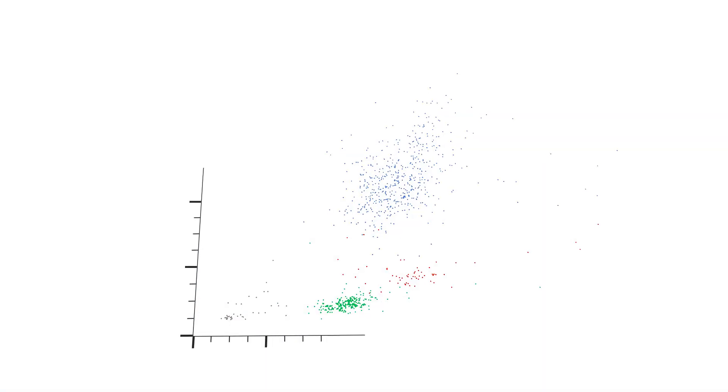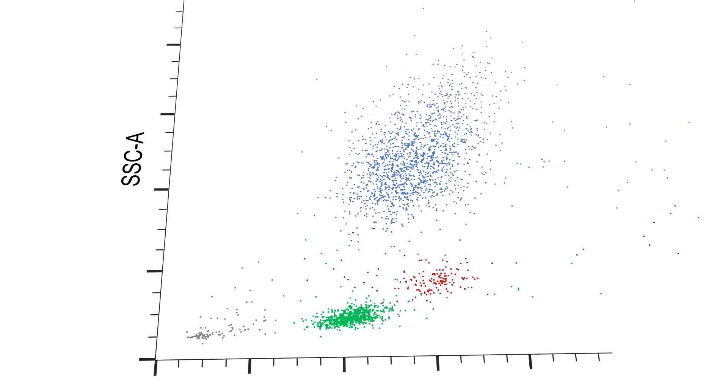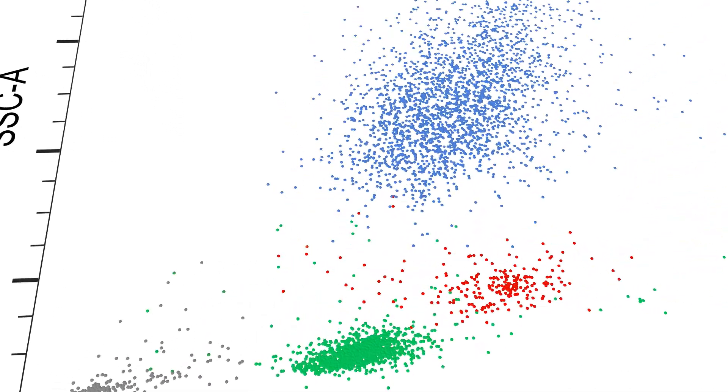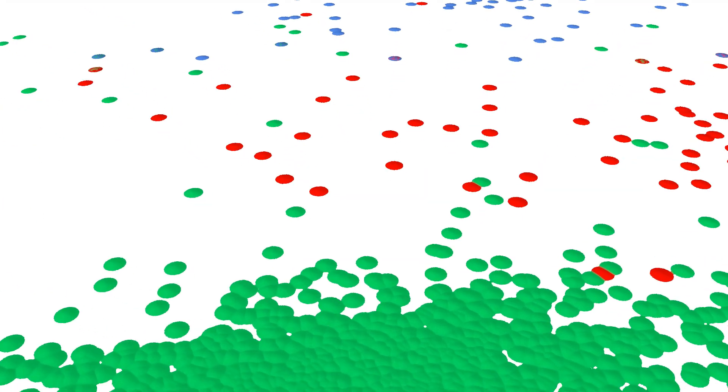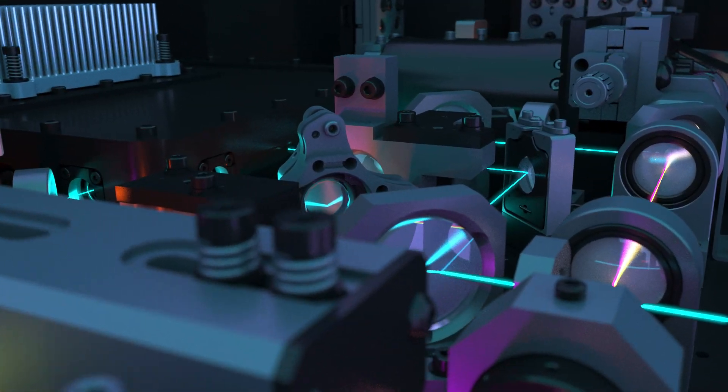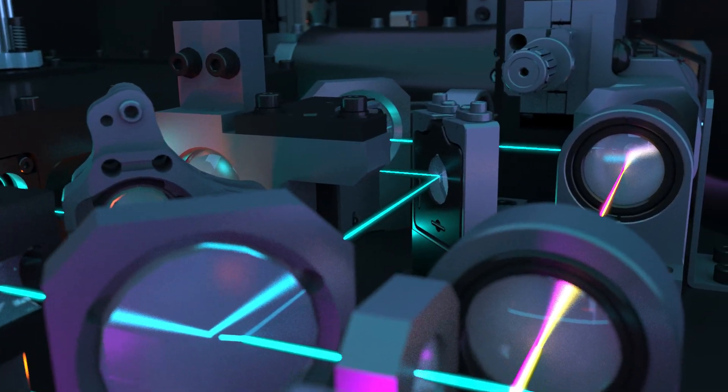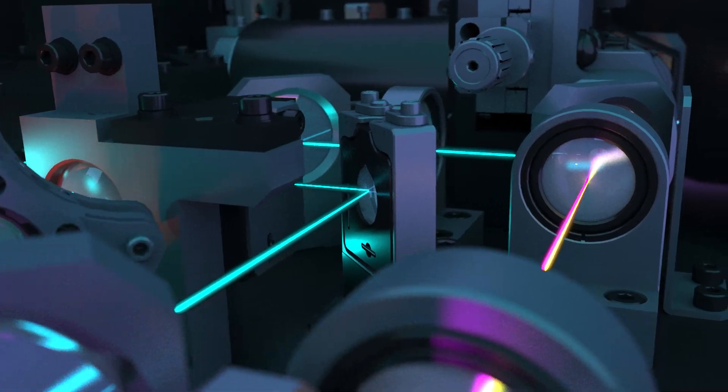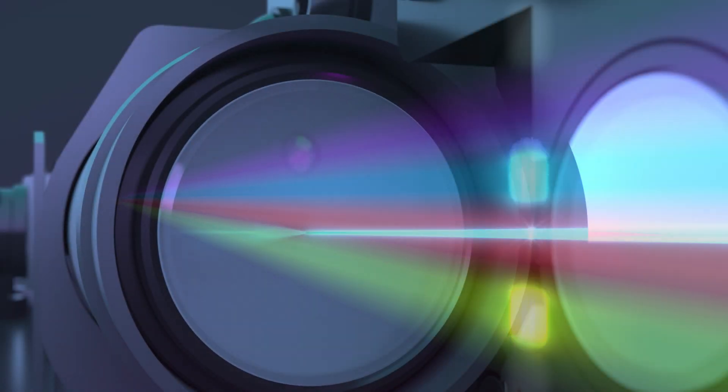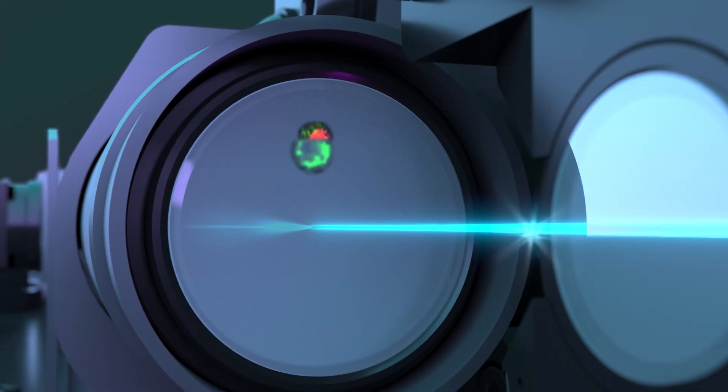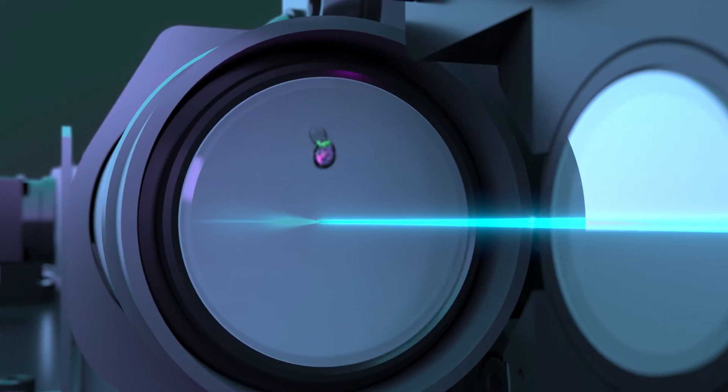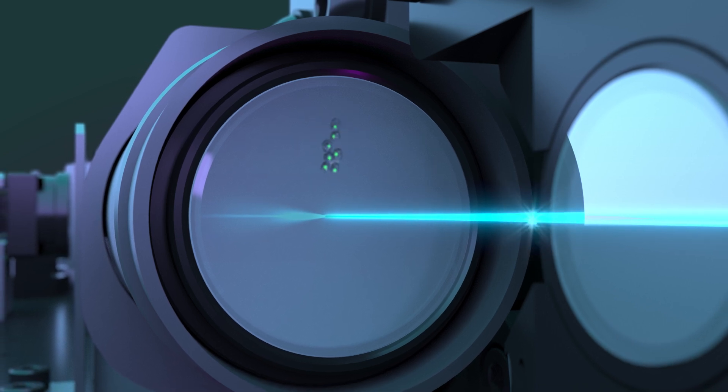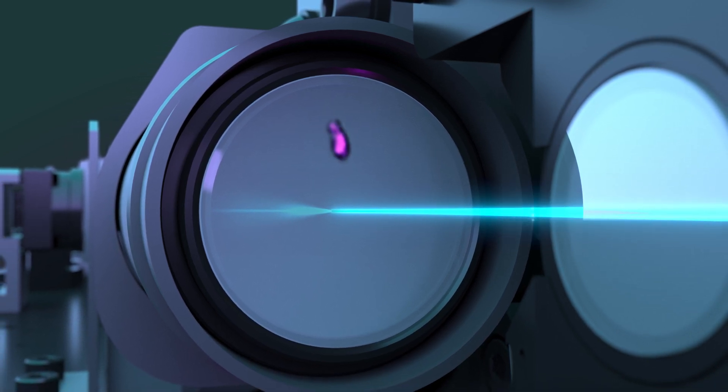Technology innovations in flow cytometry have enabled researchers to study cell populations with increasing depth and granularity. BD is taking this powerful single-cell analysis tool further into a new expanse of research possibilities with real-time imaging flow cytometry. BD CellView image technology enables imaging using scatter and fluorescent detectors to reveal the internal and external spatial characteristics of a cell without the use of a traditional camera.